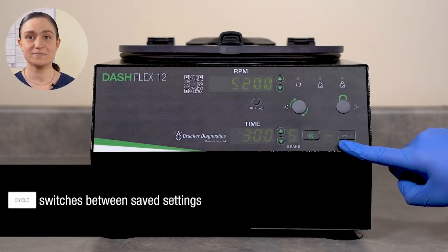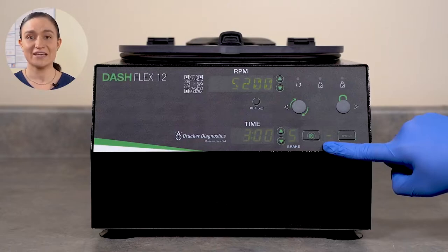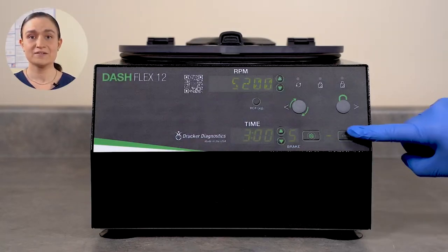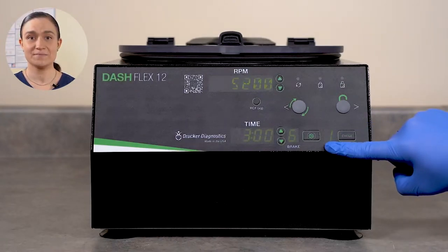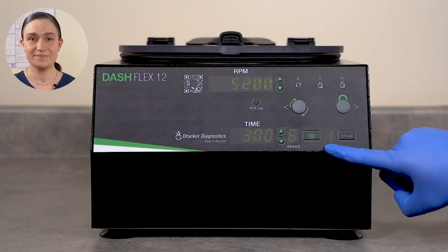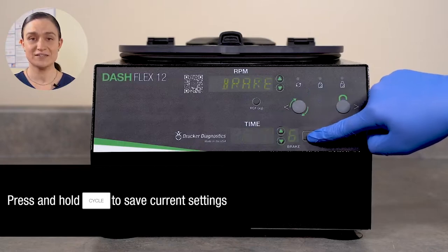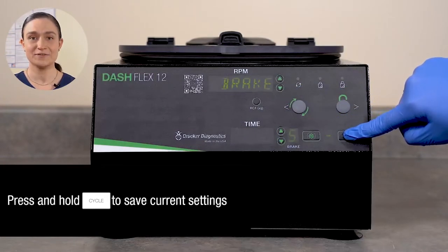The Cycle button switches between saved settings, and the display next to it shows the number of the currently selected cycle. A dash means you have no saved cycle selected. Your Dash Flex 12 can save up to 10 cycles and arrives with 3 pre-programmed cycles already set for your convenience. A saved cycle is a combination of RPM, time, and brake values stored in system memory for easy recall. The system automatically assigns each one a number and a name — Mem4 for the first, Mem5 for the second, and so on. You can create a new saved cycle by adjusting your centrifuge as desired and then pressing and holding the Cycle button.